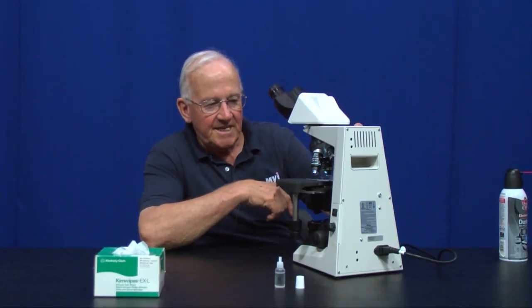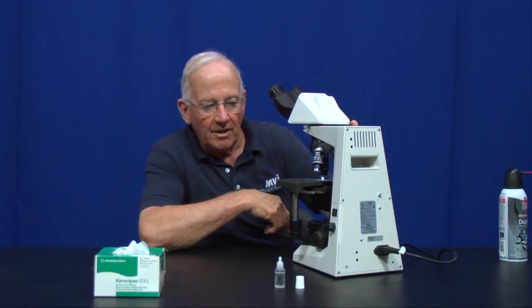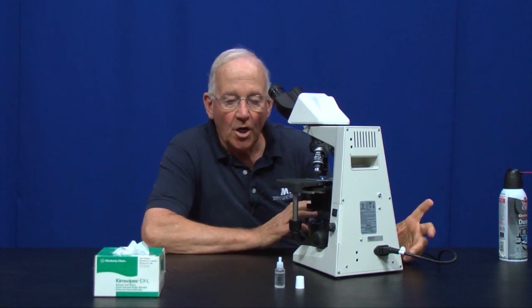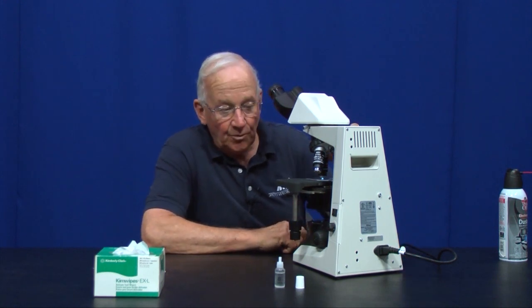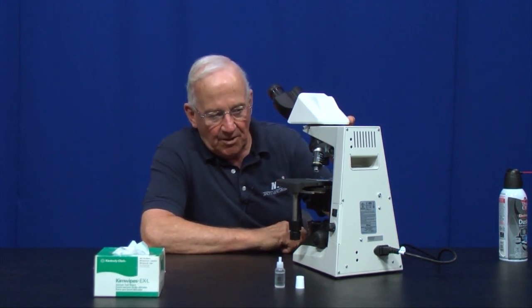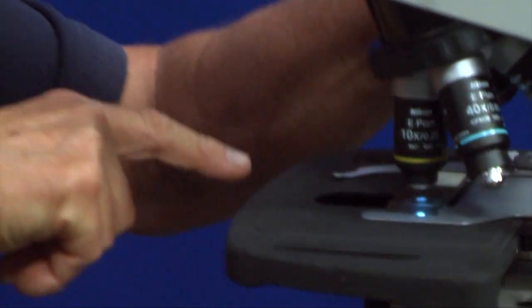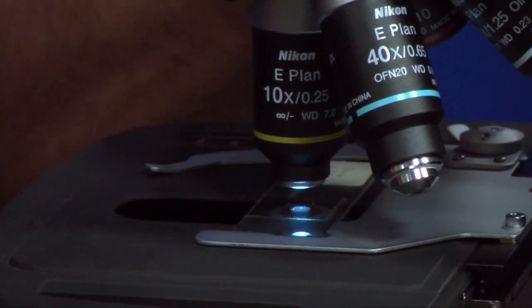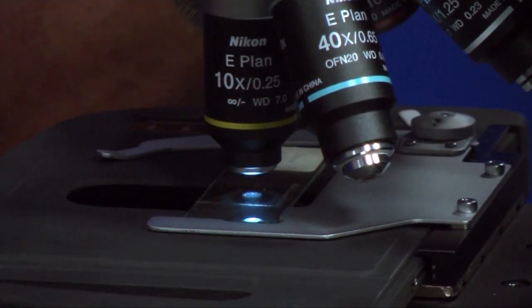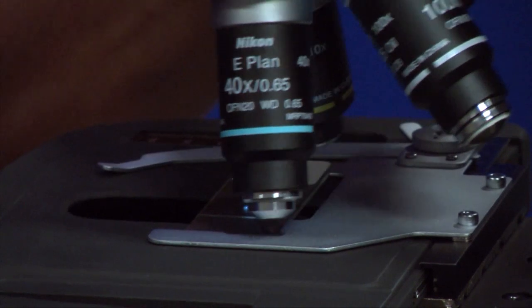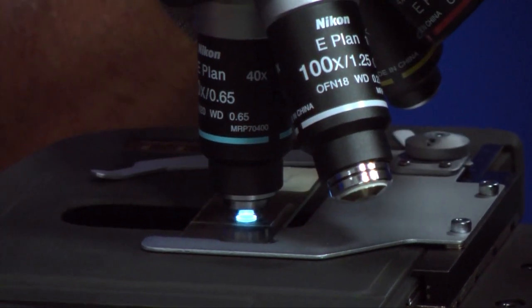None of these objectives, 4, 10, and 40, require immersion oil. Those are called dry objectives. You will notice one thing we talked about before, and that is the working distance. With the 4x, very large working distance. 10x, much shorter working distance. That's the distance between the specimen and the front lens of the objective. 40x, less than a millimeter working distance.